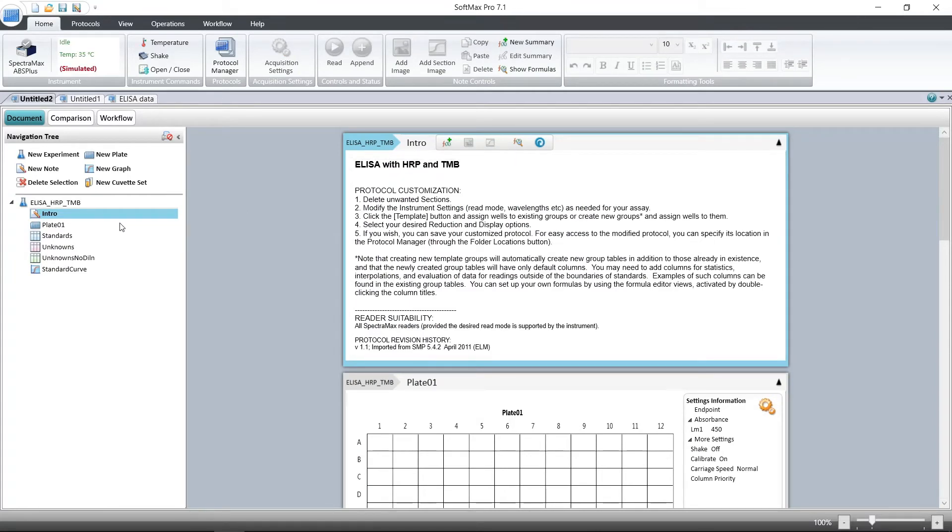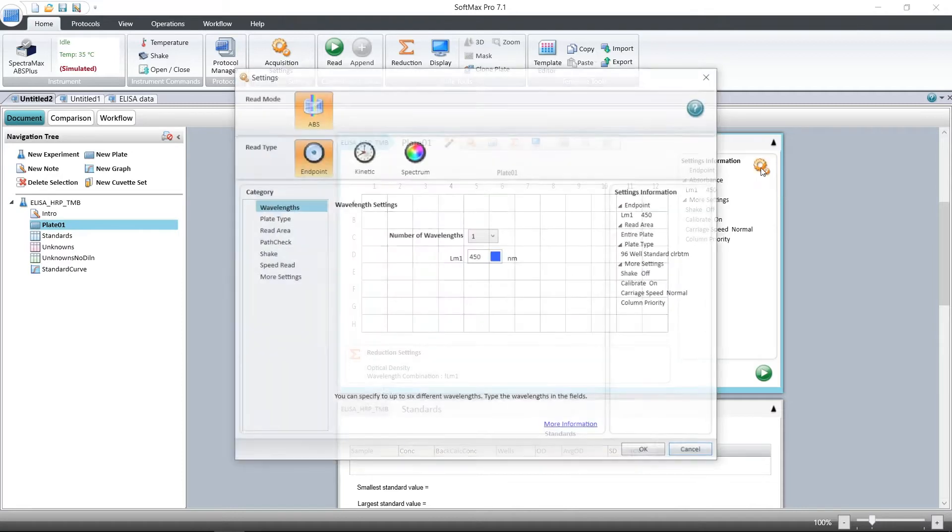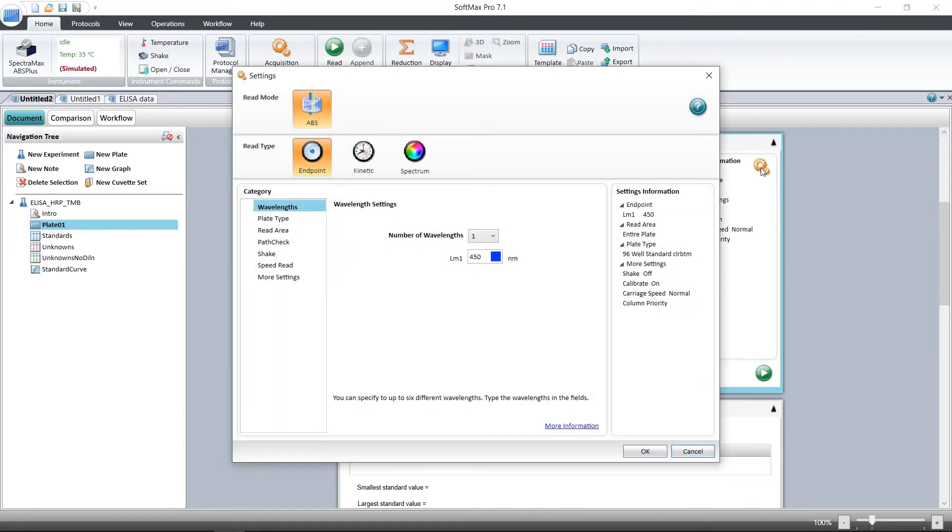Here we have a plate section where the instrument settings are shown, as well as group tables where the analysis is done. In the plate section, we have wavelength and additional settings. To change any of the settings, click on the gear icon.